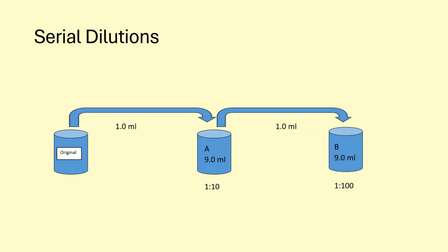So how do you do the dilution? You have your original sample. Like I said, this could be maybe a soil sample, a food sample, a water sample, whatever it is. So it could be solid or liquid. You have that original sample. What you do, in this case I'm showing with a liquid. If it was a solid, you would measure a gram of soil. If it's liquid, you're measuring 1 milliliter.